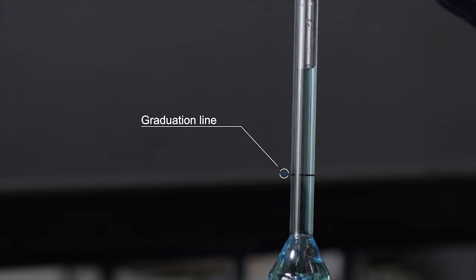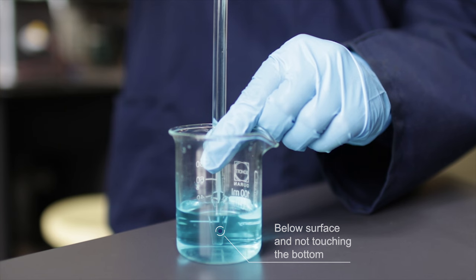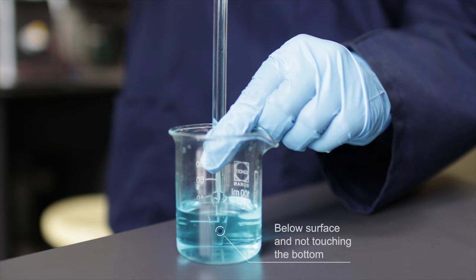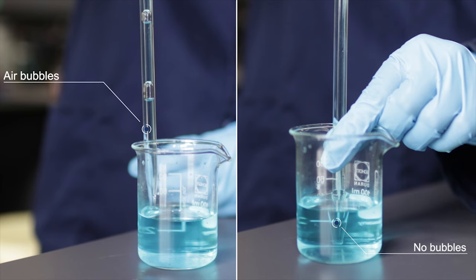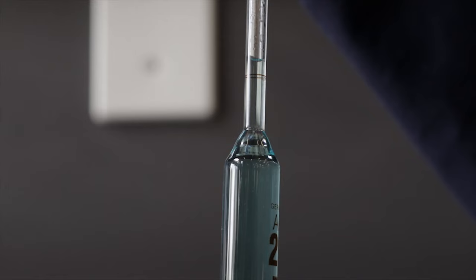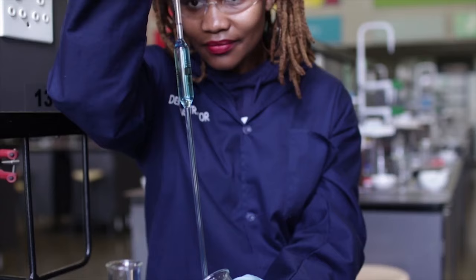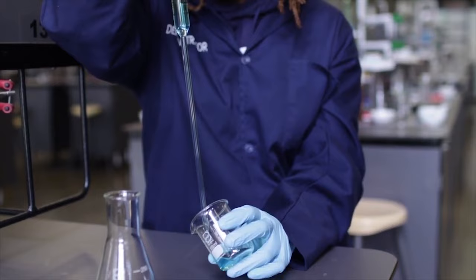Once the pipette is rinsed, the solution is sucked up to about two to three centimeters above the graduation line by rolling the knob downwards, keeping the pipette's tip well below the solution surface but not allowing it to touch the bottom of the beaker, so as to prevent any air bubbles being sucked up. This is easily done by holding the pipette against the walls of the beaker. The solution level is then adjusted slowly by rolling the knob upwards on the pro pipette until the bottom of the meniscus is level with the graduation line. Make sure the graduation line is at eye level, the pipette is vertical, and the tip of the pipette is touching the side of the beaker when lowering the meniscus.